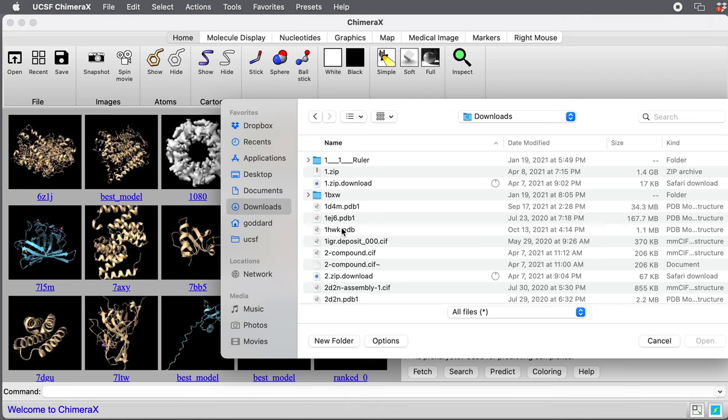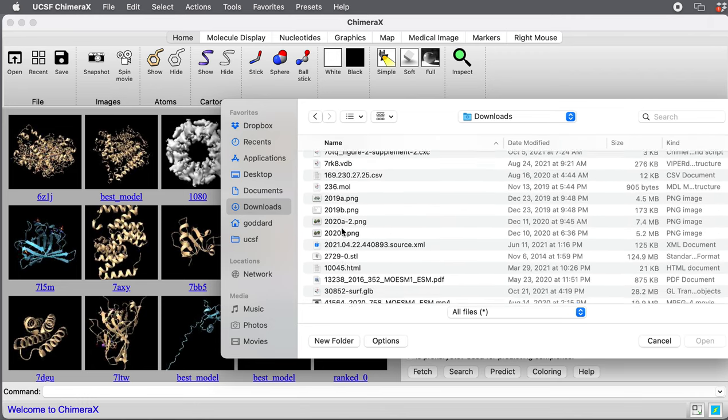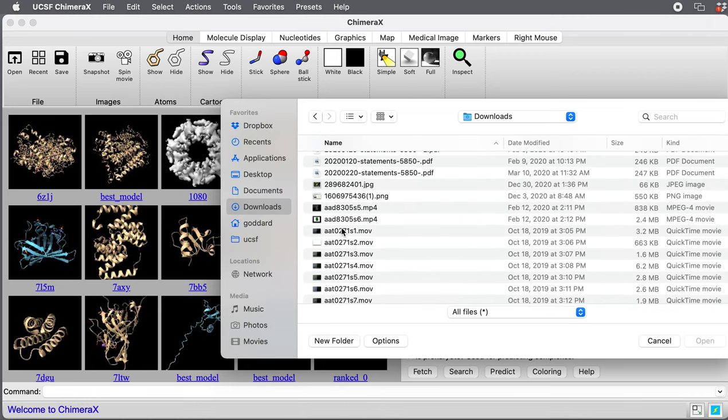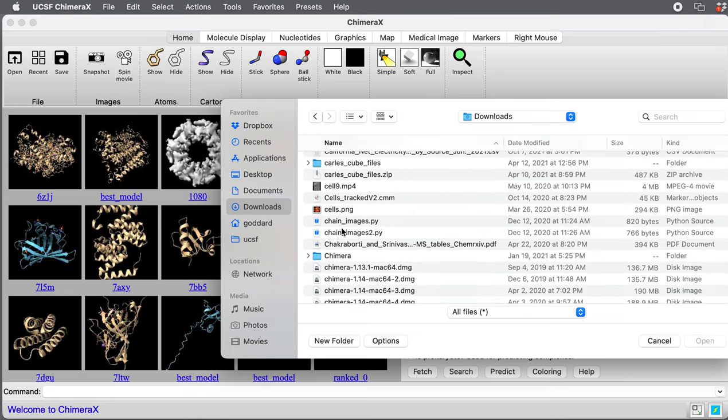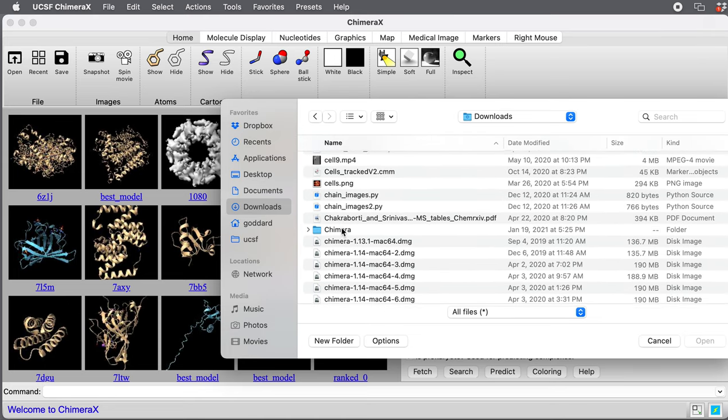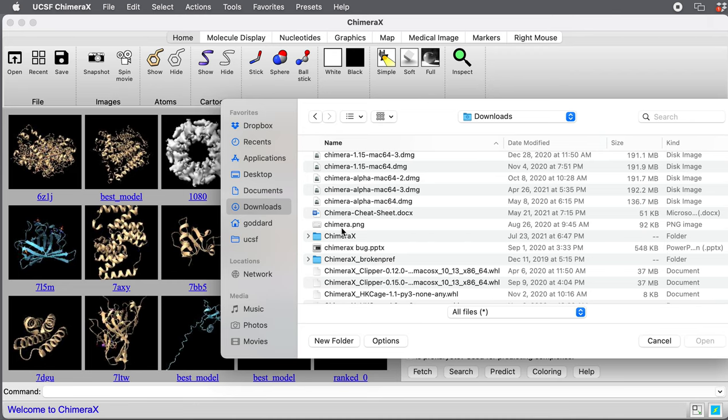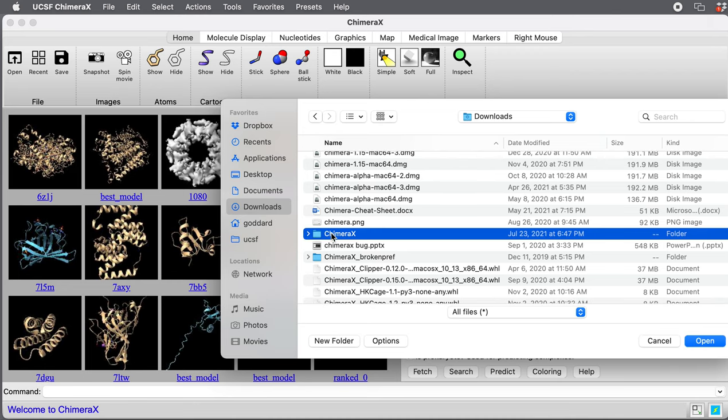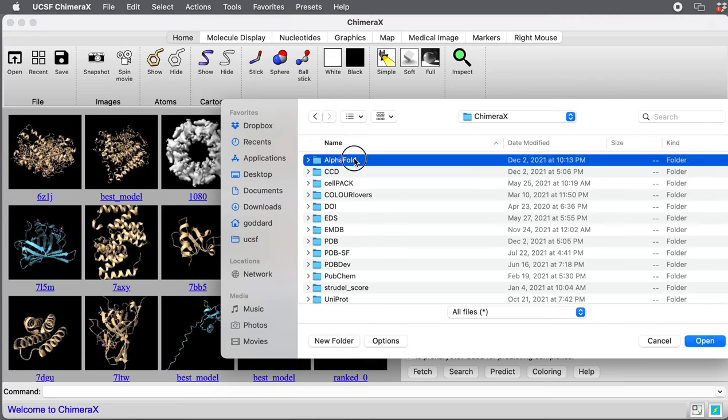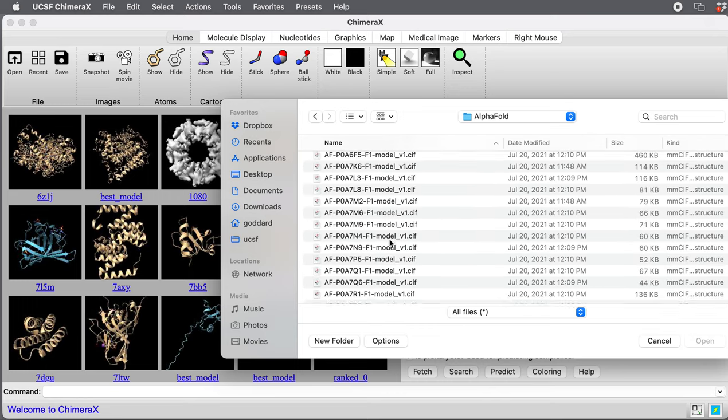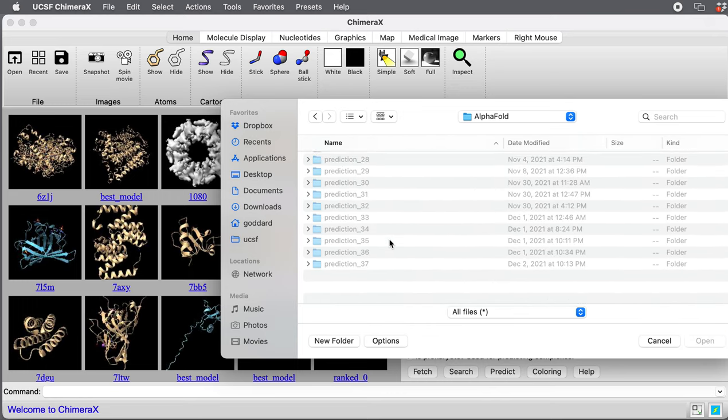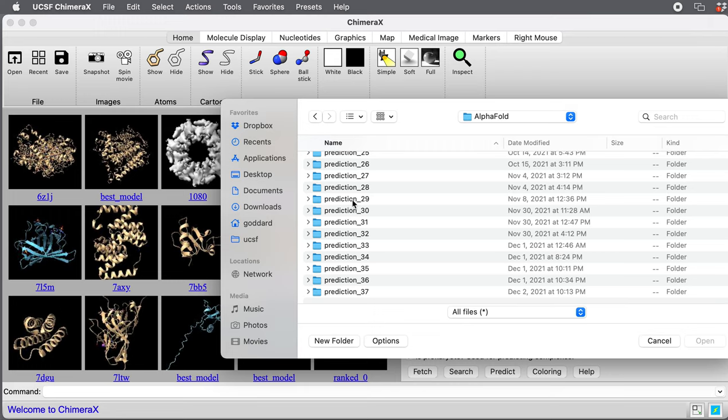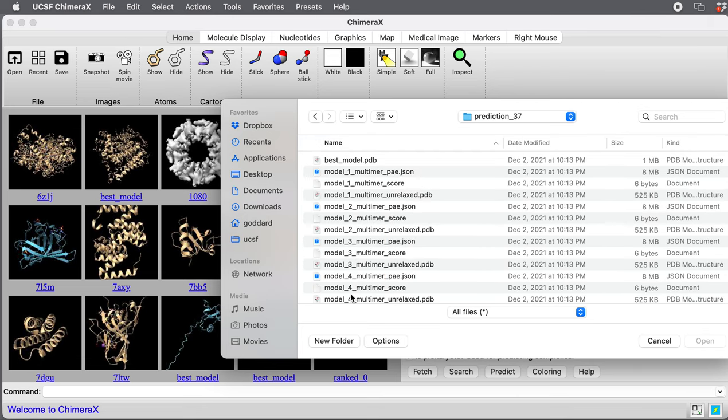It also puts it in your downloads folder. It's under downloads. I'm on a Mac here, but same on Windows and Linux. Downloads, Chimera X, and then this is where Chimera X keeps all of the data it fetches from the web. We go to AlphaFold, and then there's some directories that say prediction. If it's your first prediction, there'll only be one such directory. I've run 37 predictions. It's actually this last one, prediction 37.